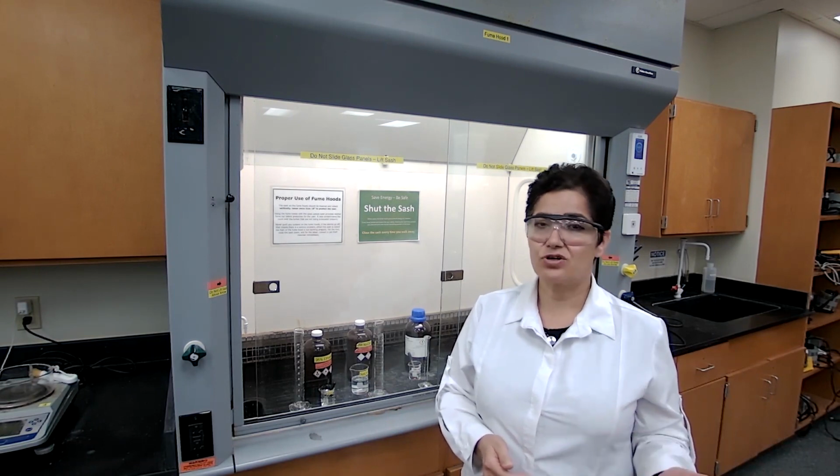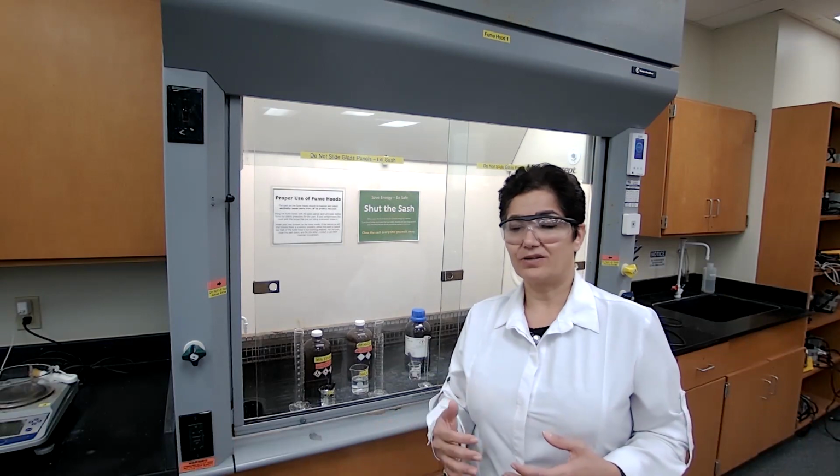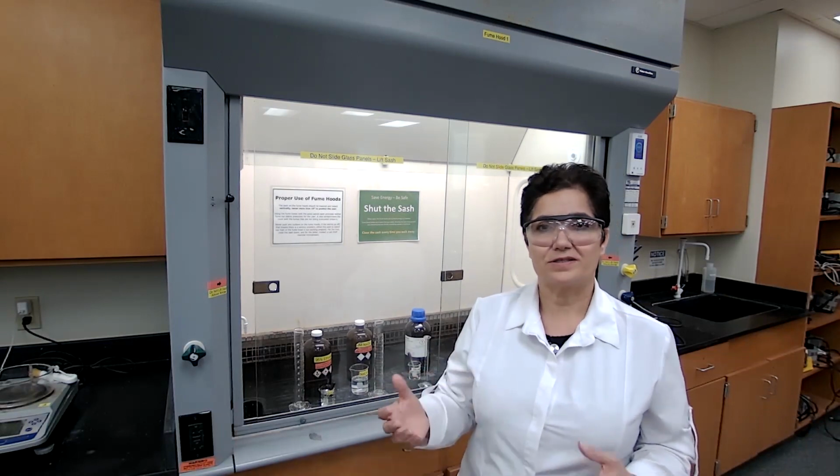The reason we are choosing this ratio, which gives basically 0.2 moles extra of benzaldehyde, is because benzaldehyde can oxidize over time. Since benzaldehyde oxidizes and changes to benzoic acid, that part is not going to be involved in the reaction, so we want to make sure we have enough benzaldehyde.